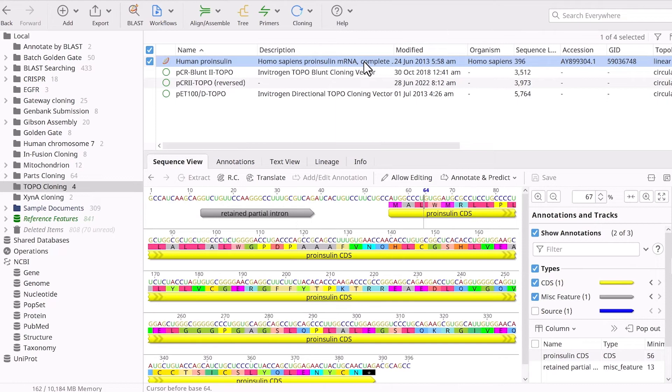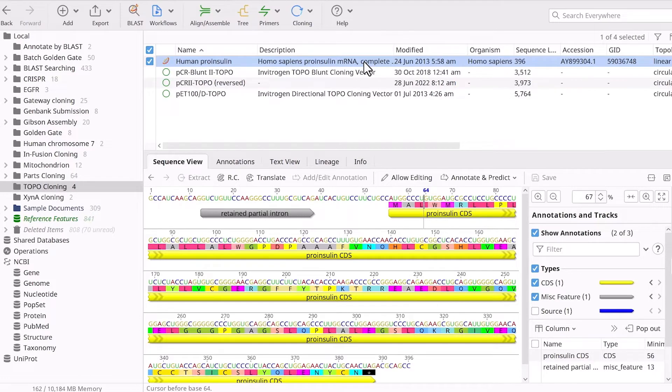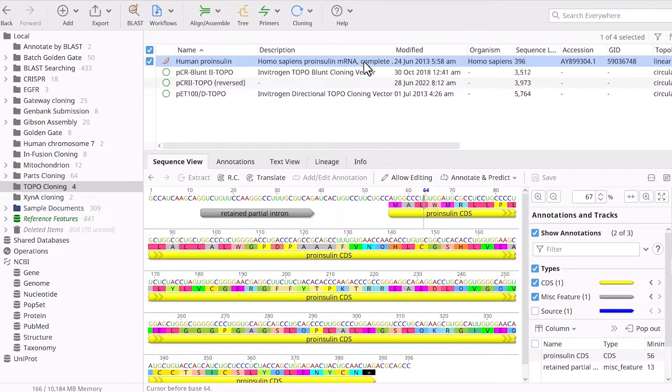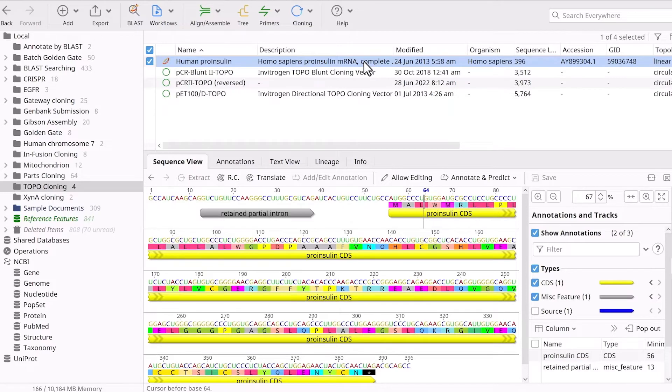Again, ensure you are happy with the sequence orientation and repeat the reverse complement if required. The insert is usually amplified in the lab by PCR with TAC polymerase, adding a 3' deoxyadenosine overhang. In Genius, there is no need to manually add the overhang to the sequence because the cloning tool will do that for you.